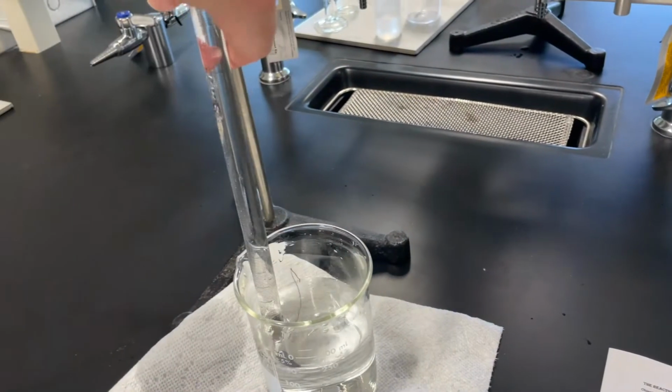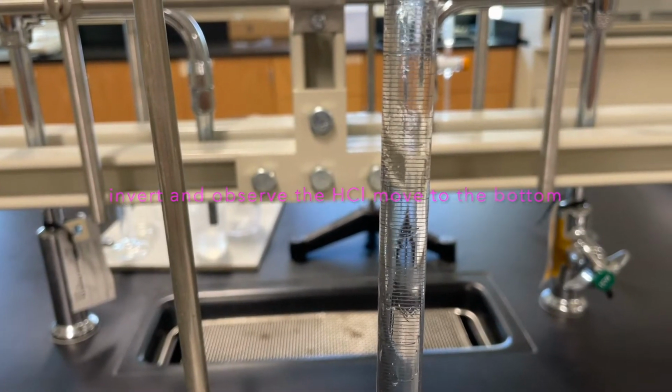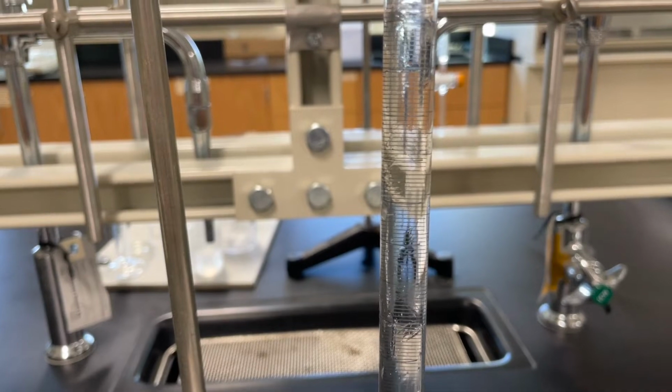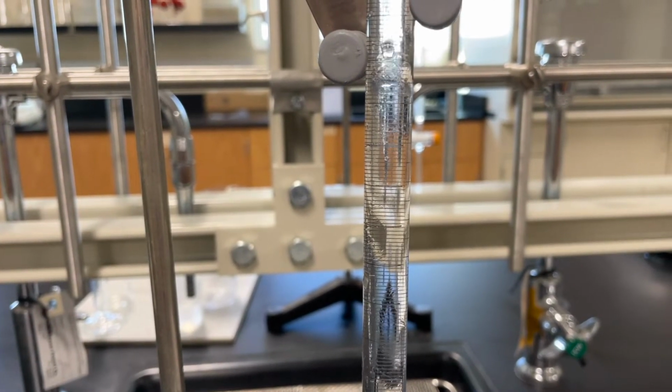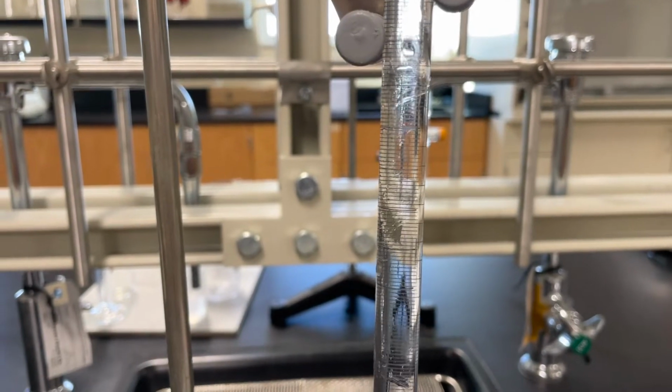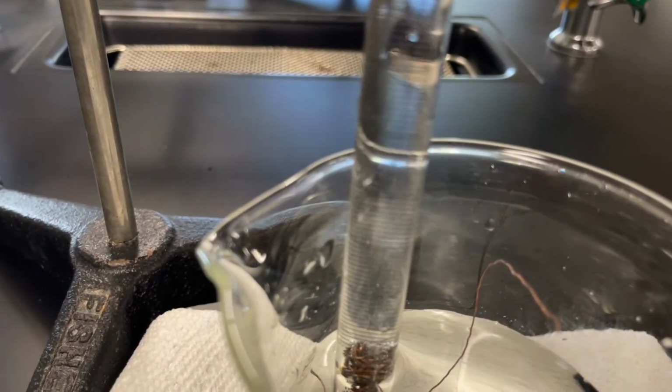And as we invert it, you can actually see the hydrochloric acid moving towards the bottom here. Look closely, it is more dense than water, so you will see it begin to fall. And it will reach the bottom where our magnesium lies, and it will begin to react. And you'll start to see the evidence of a chemical reaction almost immediately.